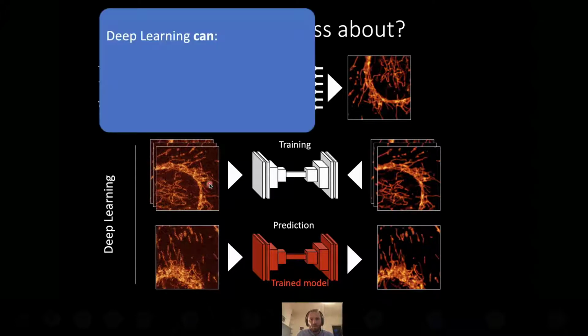And so with this very general and very shallow overview, I'd like to highlight a couple of extra points. First, deep learning can, in principle, approximate pretty much any transform. I've not put any restrictions in terms of what can be fed as input and output, and that makes deep learning extremely versatile. So a very large number of image analysis tasks can be performed. I'm only presenting image-to-image transforms, where many other types of approaches can be taken.